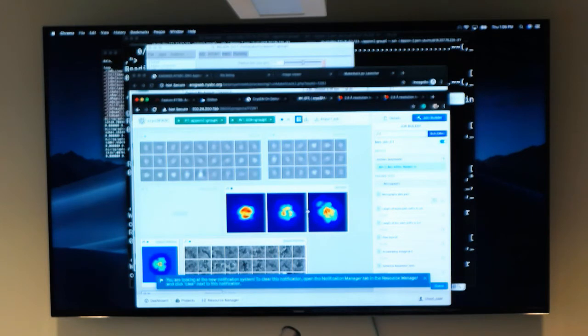What's the GPU that we're using? No, meaning in the Amazon instance, what's the GPU? It's like K80, I guess. Meaning you can exceed the processing capability. So we have cards, but I think they're pretty good, but GPUs eventually run out of memory. Yeah. So it's one of the areas. But that's reality, because let's say you bought a workstation, yeah, that's true, then GPUs are horrible for you because then you need CPUs.